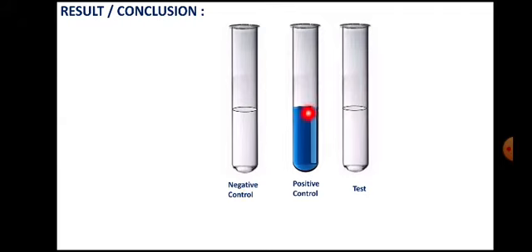Now here we have added raw milk sample in which phosphatase enzyme is active. So phosphatase enzyme will convert disodium phenyl phosphate to phenol, and when we add CQC reagent, CQC reagent will react with phenol to form indophenol blue. Now this is the color of the solution. It looks like this, and this is your test milk sample.